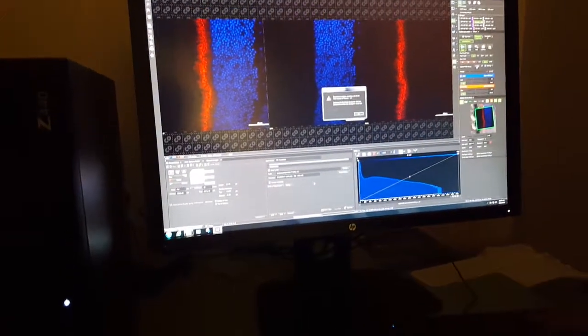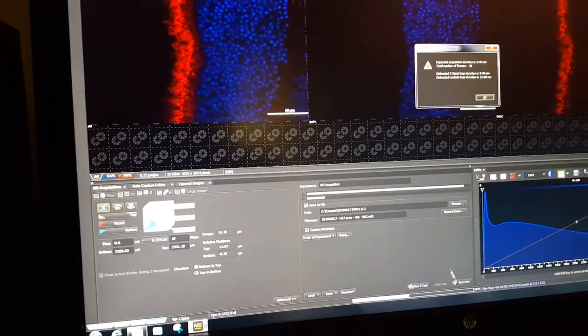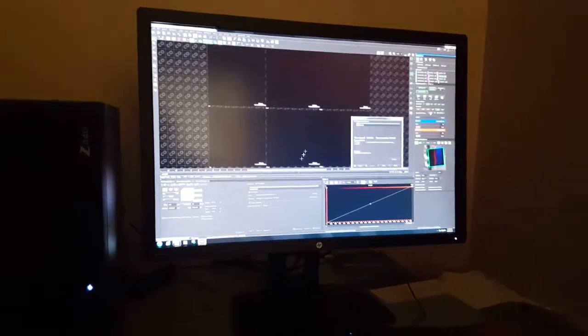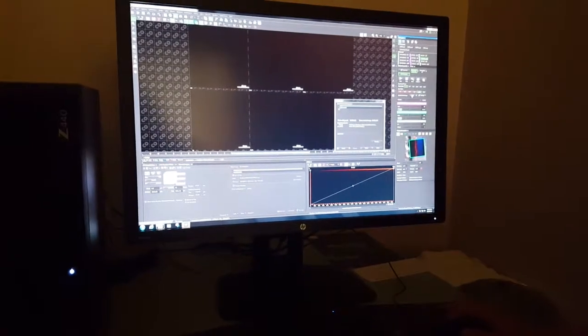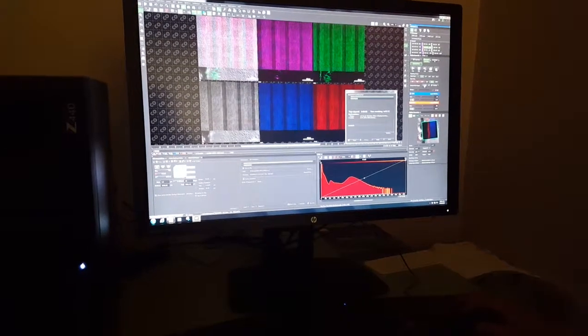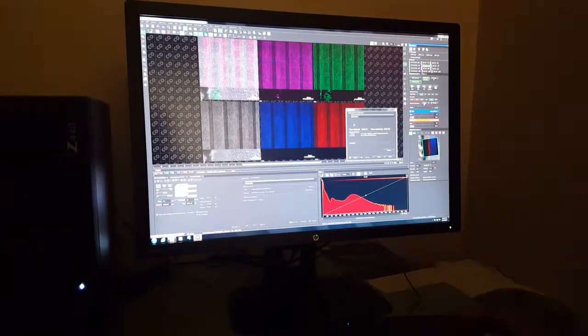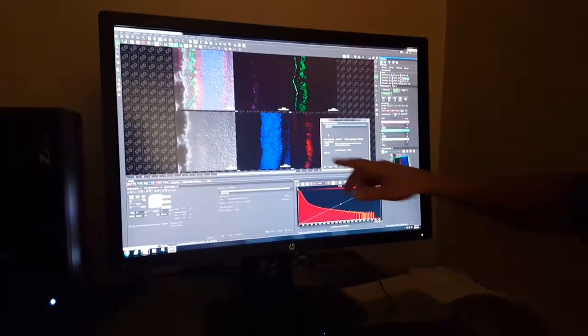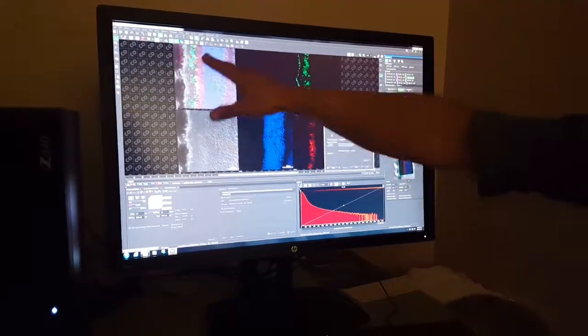Saying that, we can go to timing here, and we are going to make the same steps, and we have the timing that is telling us it's going to be 4 minutes. Okay, and we put run, and we are going to have 2 lines, one for the red and blue and another one for the green and the magenta. Now it's the green and magenta. It's taking the pictures. Later on they take the picture of blue, red, the DAPI, and all together. Okay?